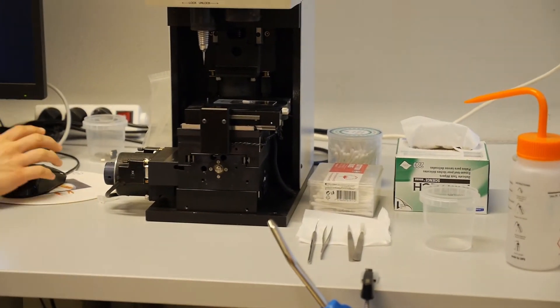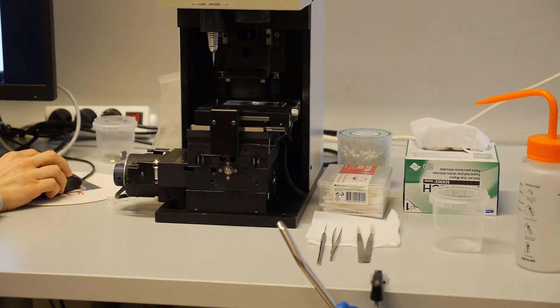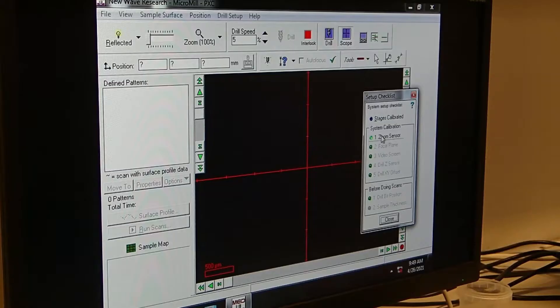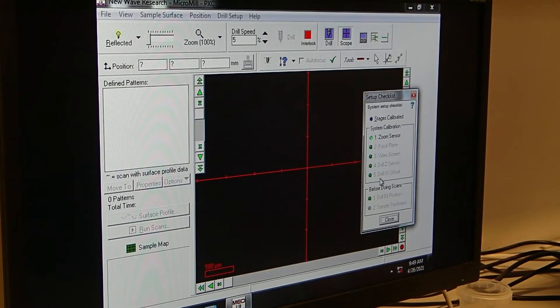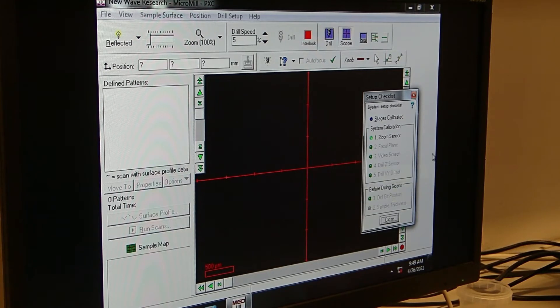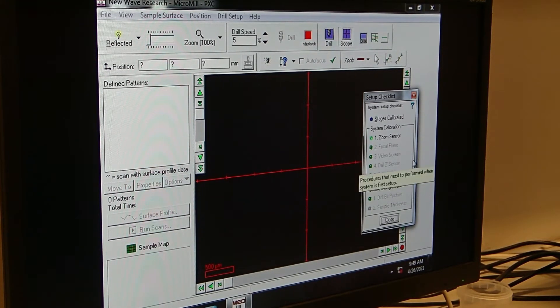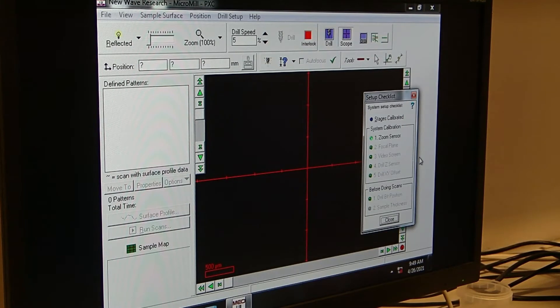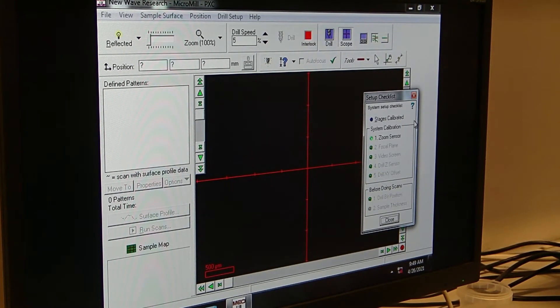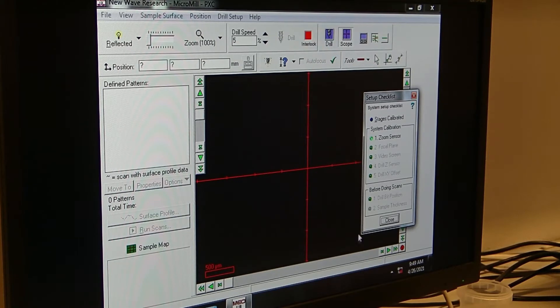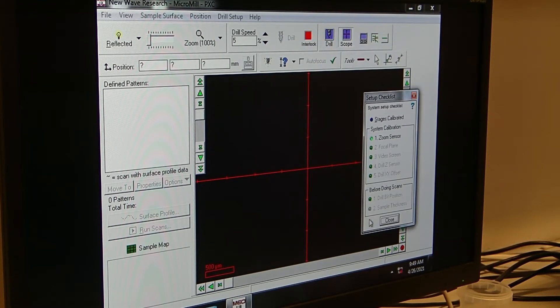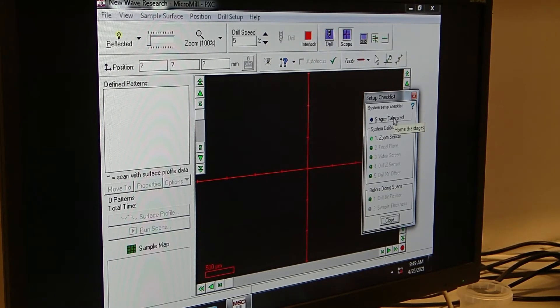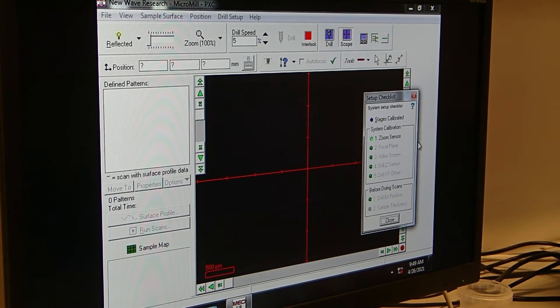Next is to set up the checklist. The system calibration doesn't have to be done every time, just if you have done major changes like if you have replaced spare parts. What always has to be done after you restart the software is the stage calibration and then also the sample thickness for every new sample you take. The first step is the stage calibration and I'm going to guide you through this now.